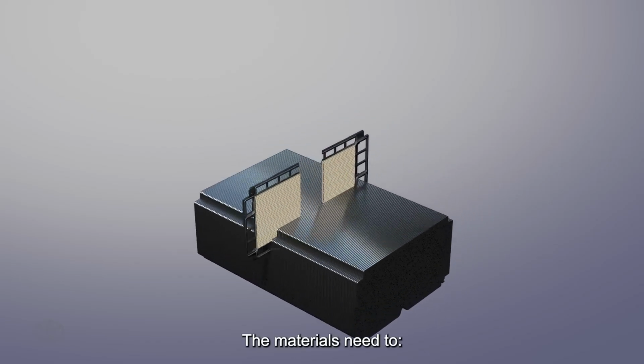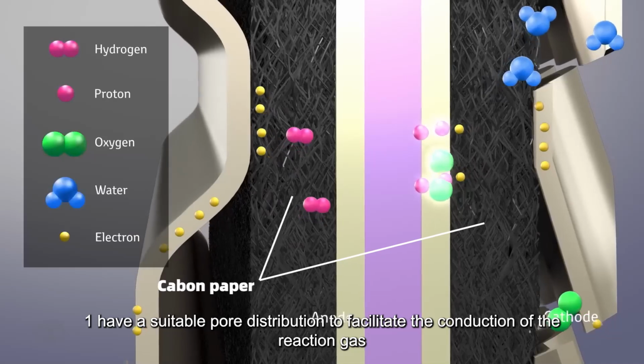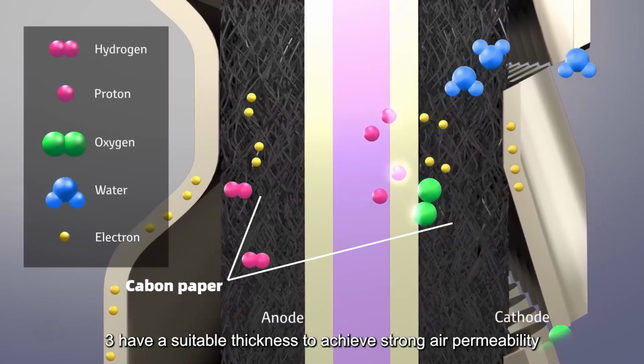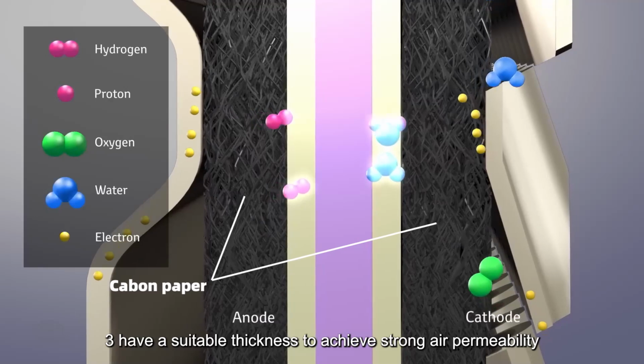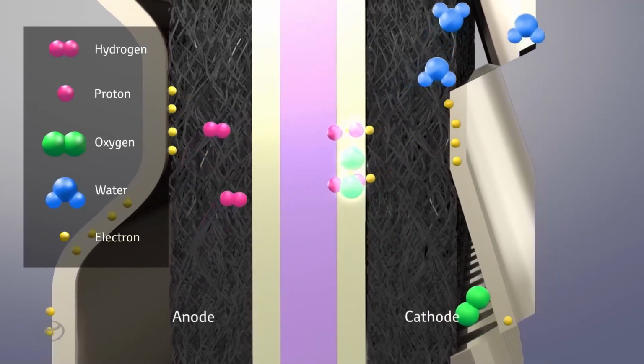The materials need to: 1. Have a suitable pore distribution to facilitate the conduction of the reaction gas, 2. Have good strength to support the catalytic layer, 3. Have a suitable thickness to achieve strong air permeability, strong support and low cost.